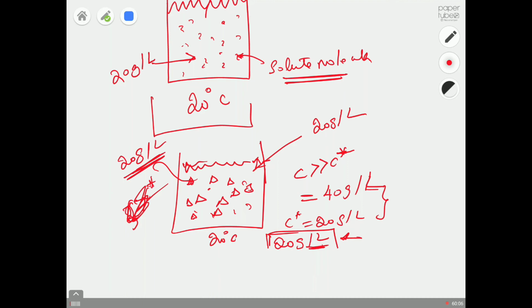But always remember there is room to make a supersaturated solution where your solution concentration can be above your solubility concentration, and still you will not have any solid particle in that solution. If you know these two, you cracked 90% of the crystal growth problem. If somebody asks you to purify an API compound, with these two concepts in your mind, you will know how to purify a compound, and you will know how to perform a crystallization experiment. So try to keep these things in your mind.